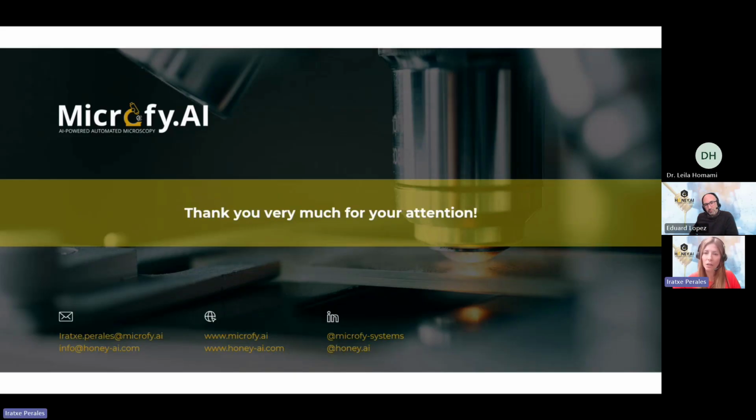They are unknown. When you select which model you want to use, you indicate global, and our system is able to recognize which pollen are not trained. As with a human, who also has an unknown percentage of pollen grains, we have a group of pollen species which for us is unknown, and it's a percentage.